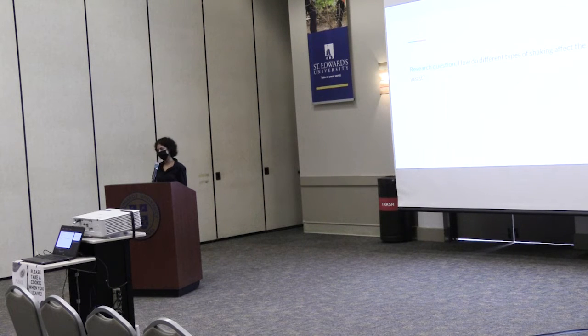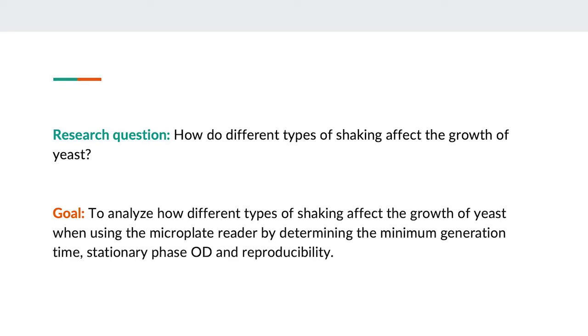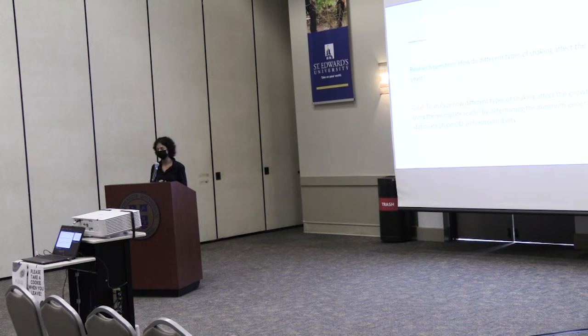So our research question: how do different types of shaking affect the growth of yeast? Our goal was to analyze how different types of shaking affect the growth of yeast when using the microplate reader by determining the minimal generation time, stationary phase OD, and reproducibility.